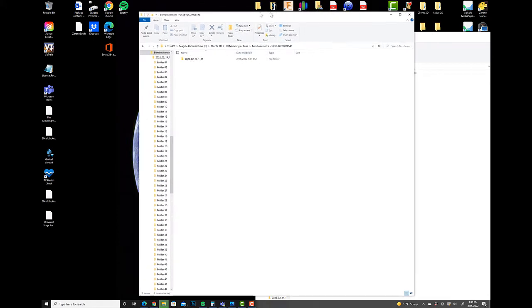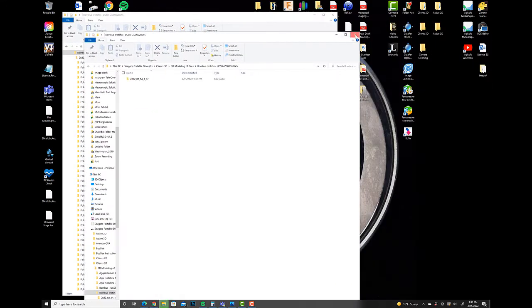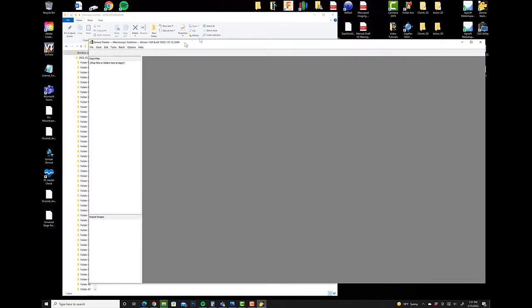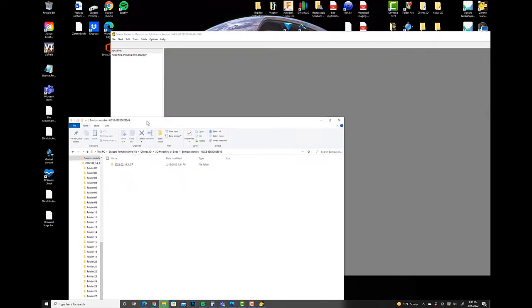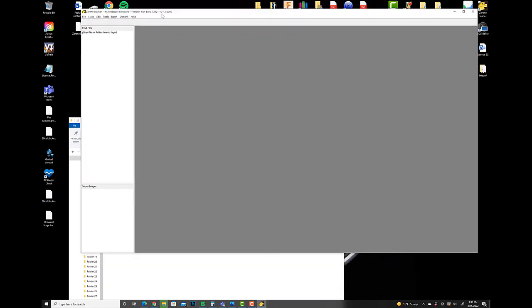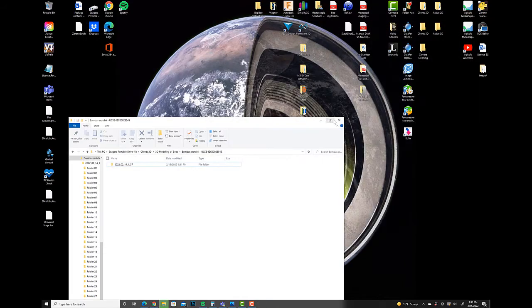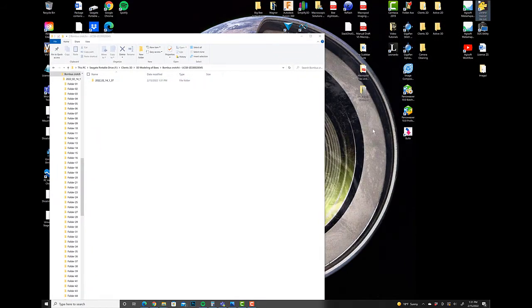All right, the next thing we want to do is start focus stacking. So we're going to open up Zerene Stacker. We're going to drag the folder into the input section. Oh, sorry, that's a mess up. So we're going to open, okay. All right, so now we're going to open Zerene Stacker and we're going to be batch processing. So we're going to open the batch dialog.